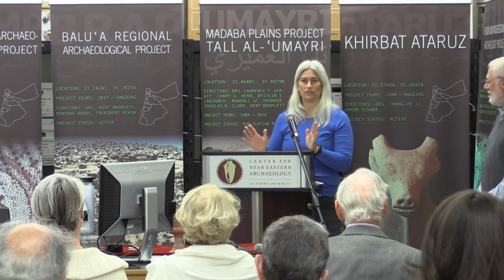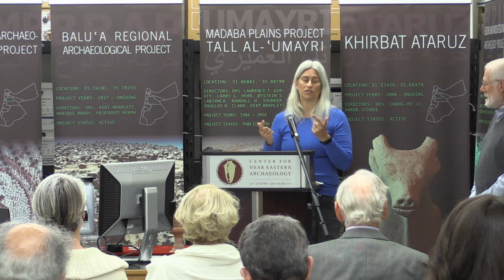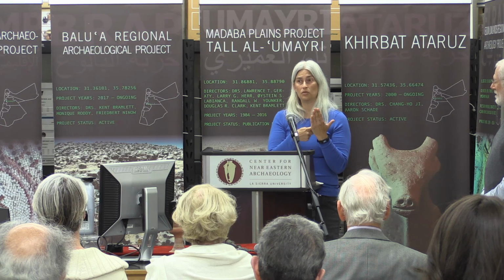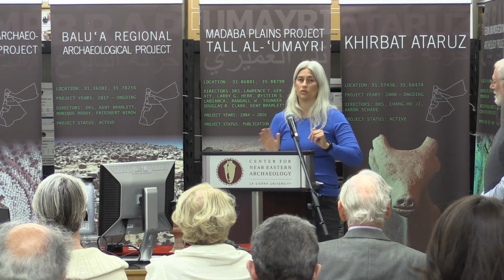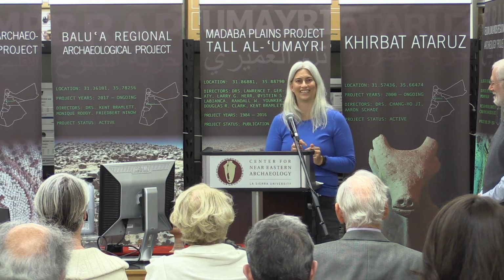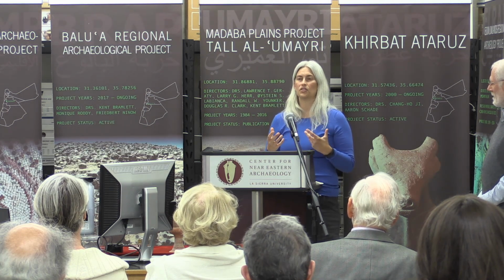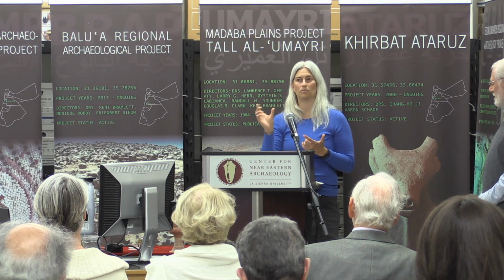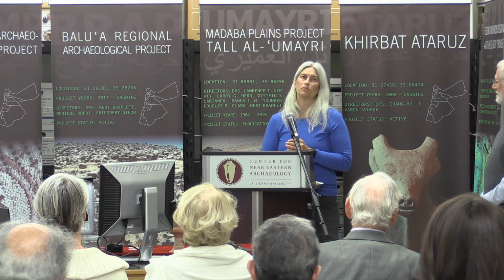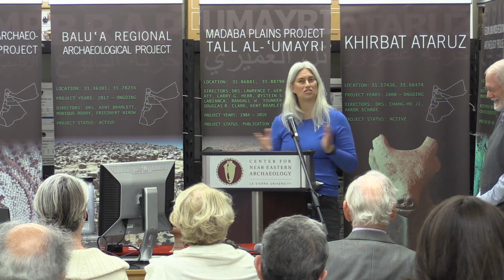So take, for instance, glass, right? If I say the word glass, you already have a picture in your mind of what that's looking like. But what you aren't having in concept there is when light goes through glass, the glass absorbs some of that light. We don't always notice it. Sometimes we do, sometimes we don't. Some glass, if you're behind that glass, you will not get a sunburn. Great, hallelujah. Some glass, you will still get a sunburn through it. And so inherently that glass is letting through that UV light that is giving you that sunburn, and sometimes it isn't. And so when we measure color of glass, that is a different type of measurement than what we would use this instrument for, because then we would measure what's going through the glass and being absorbed by the glass. The Munsell books are decent at doing it, and they don't require electricity, which I get, and that's fair.